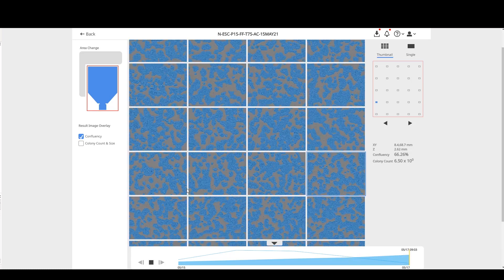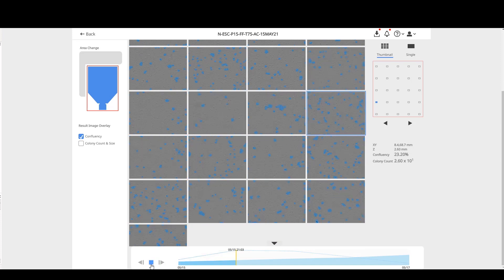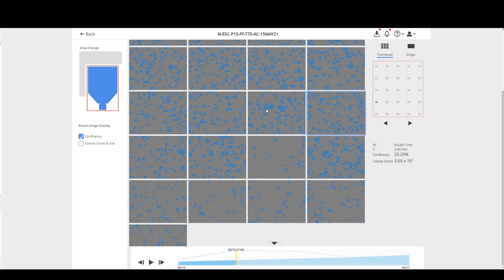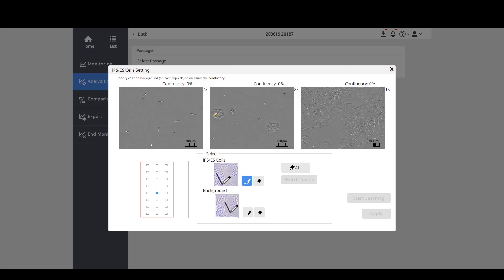The system's AI technology automatically measures the health of cell cultures using consistent parameters. This provides quantitative, reproducible data. Simply teach the system by highlighting a few cells or colonies and paint them in. The algorithms do the rest of the work.